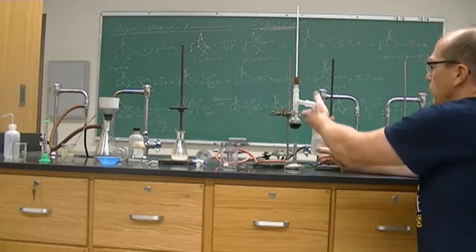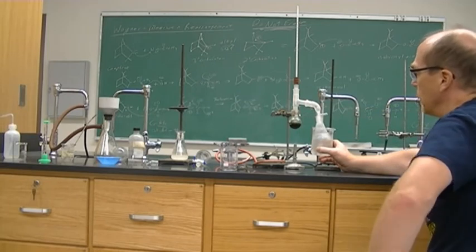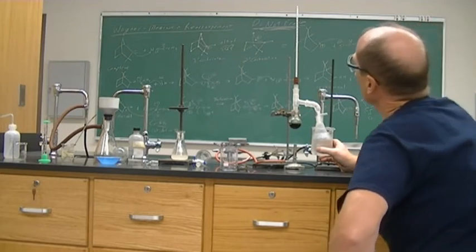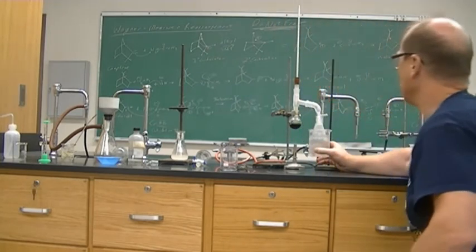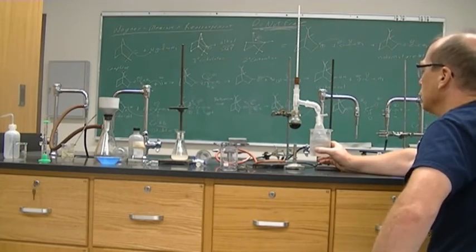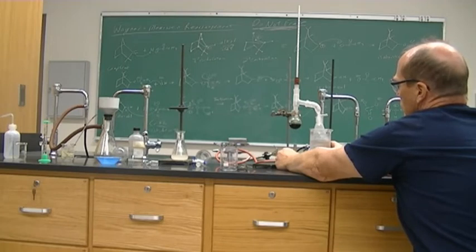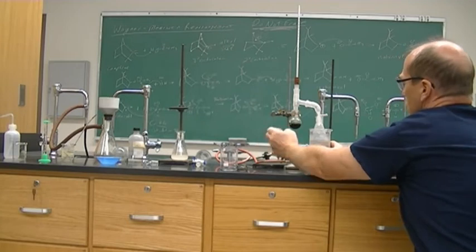Good distillation, not boiling over. You can see the green going up to here. We definitely don't want to be collecting green over here. So distillation is going at the right pace. And temperature, still about 104. Too high.